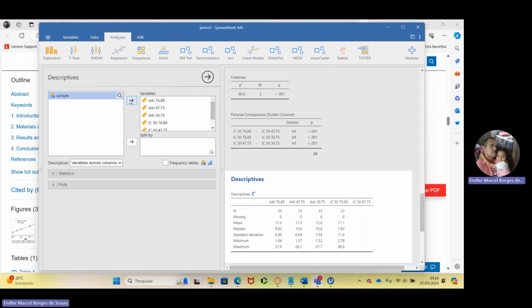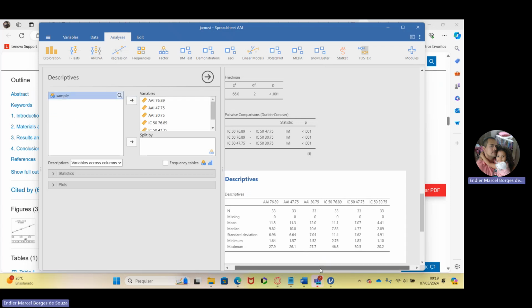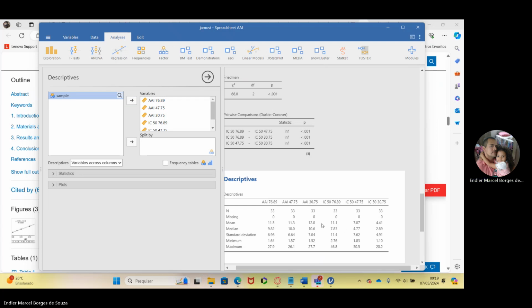We might add these 3, and you can see that this set of 3 indexes has a large numerical difference, but this other set of 3 doesn't have a large numerical difference. The numerical values are very close. So in this situation, the choice of the tests might dramatically affect the results which you can get.